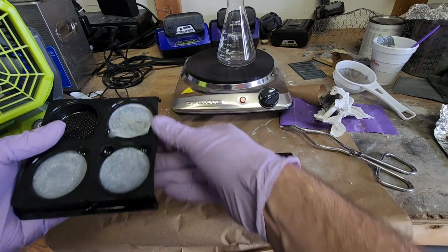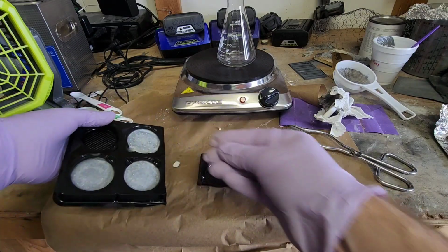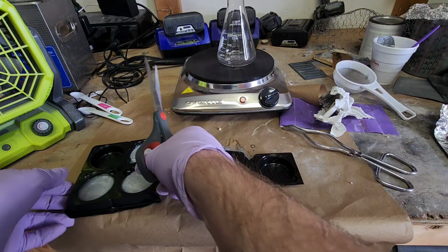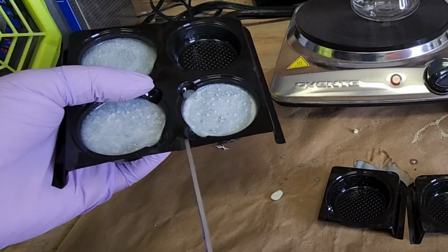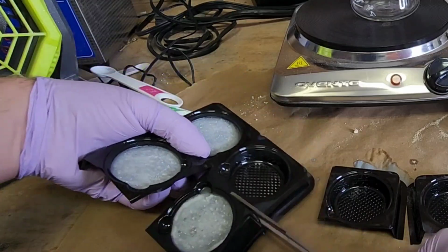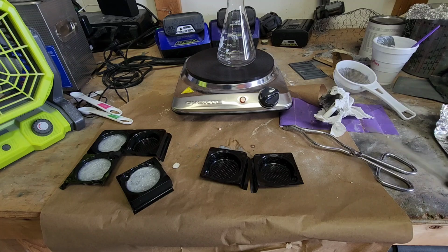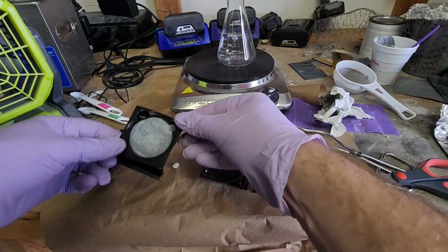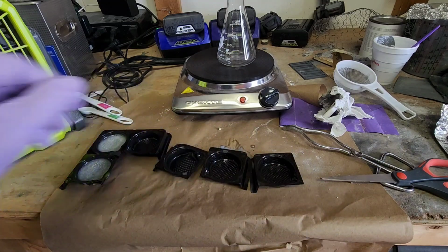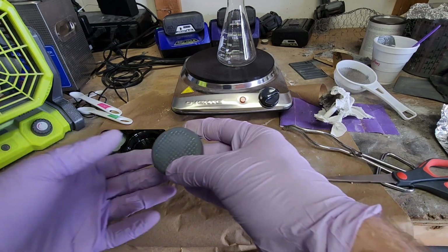The intent is that the frozen piece here is demolded, and this might be a tricky thing to do. Let me just cut this out so I don't ruin the other ones. So we'll cut one of these out. And if it doesn't work, it's not a big deal. I'll just remix the contents or find something else to use it for. But just so you see what this looks like, we can demold it here. Oh. And there we go, it survived.